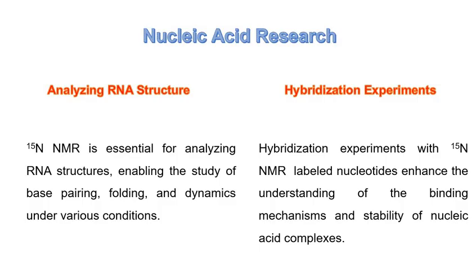Conformational changes in RNA, secondary and tertiary structures, can be studied upon ligand binding. It enables the exploration of RNA folding, dynamics, and interactions in solution. Hence, N15 NMR is essential for analyzing RNA structures, enabling the study of base pairing, folding, and dynamics under various conditions.